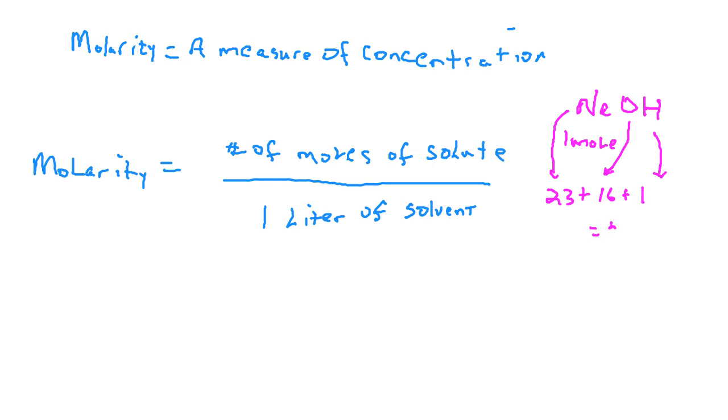So we would say this is a 1 molar solution, 1M, of sodium hydroxide.